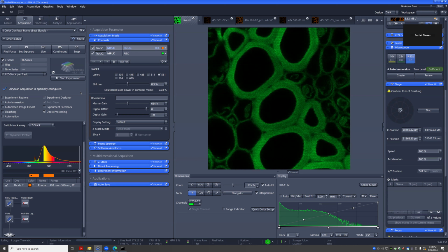Also, say something crashes, like the software gets hung up on something and doesn't come back and you have to reboot. It's just a matter of forcing the software to close, then power down the system fully, wait a minute, and power it back up. You don't have to keep it on or off for a certain amount of time.